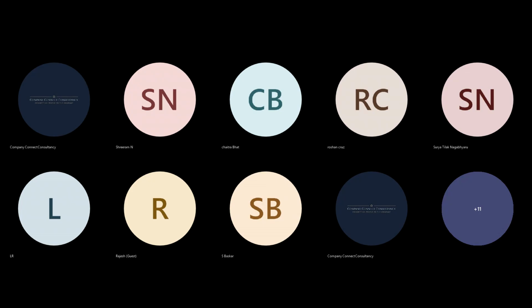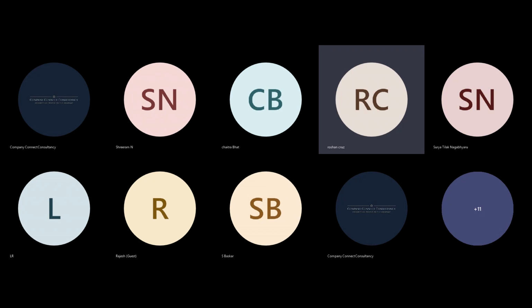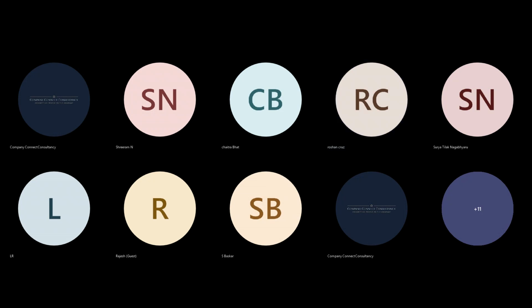Yes. But the point is, I don't have access to LabWare. So I have certain screenshots, and with those screenshots I'll tell you where you will go, where you will click, what you will do. You don't need to worry, because what is static data? What is the difference between static data and dynamic data? How to build static data? Which tables are related to static data? How those tables are linked? All those doubts will be cleared 100%. I'm telling you.